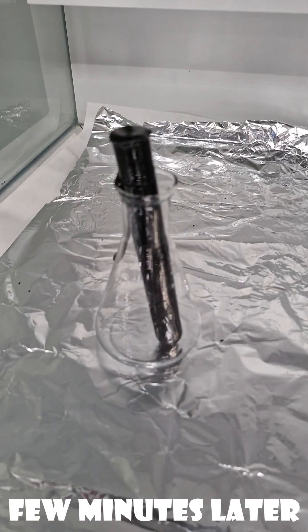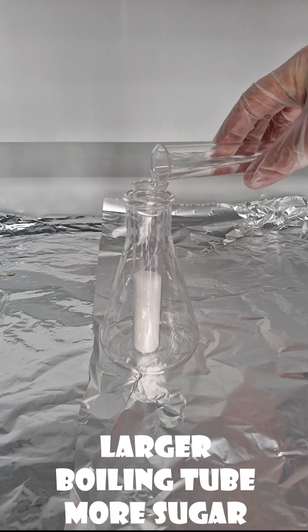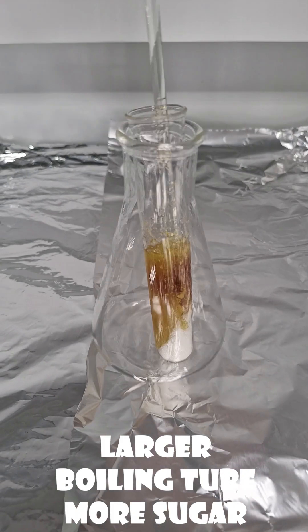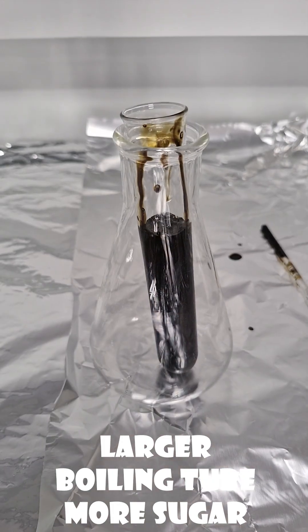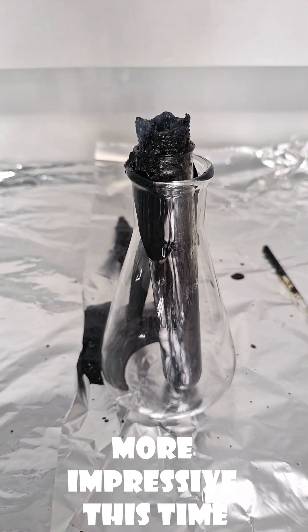You can see it's starting to bubble with all the steam coming out. On a bigger experiment, we put it in a boiling tube with more sugar and we see it rises up. It's really quite cool and it creates this black carbon. It smells of burnt sugar. Get your teacher to do it.